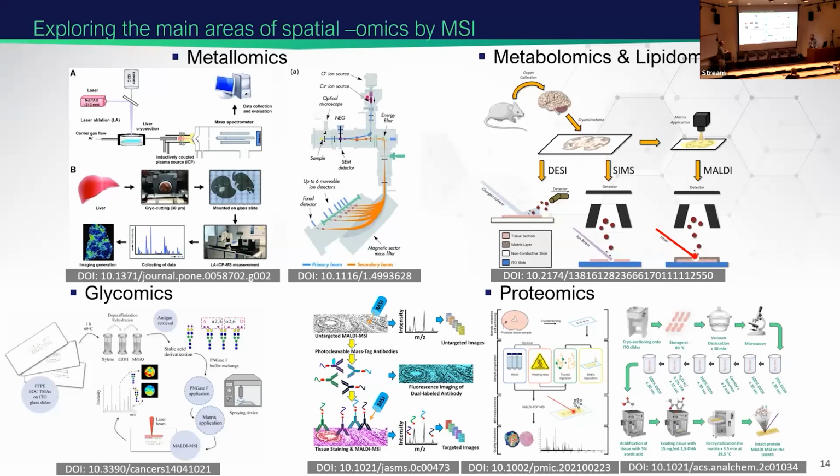We can bridge from that atomic space back into the molecular space and do metabolomics and lipidomics, and whether this is from DESI, SIMS, and MALDI, which we'll explain in a little bit. Like I said, there's an acronym zoo out there, so I'm sorry about that. I'll keep on apologizing throughout, but we can go ahead and do a lot of non-targeted metabolomics and lipidomics, and based upon what technique we actually have, we can detect different biomolecules throughout.